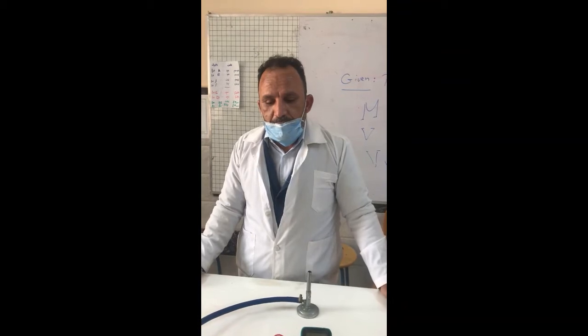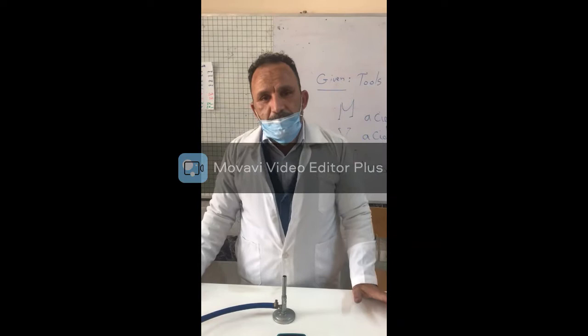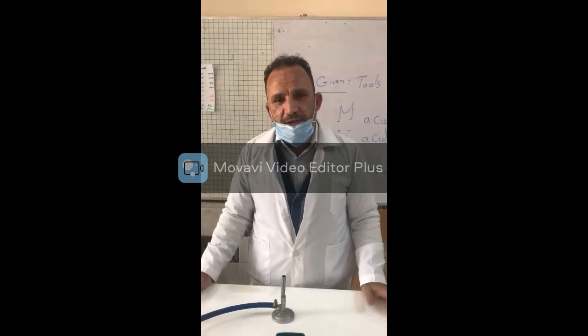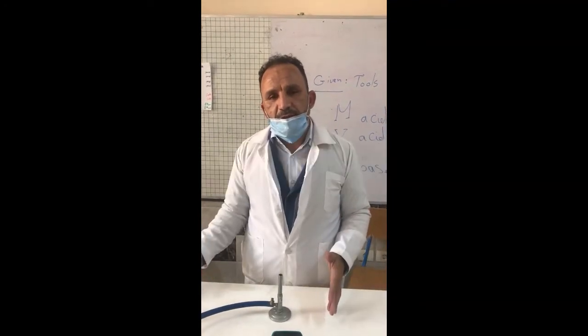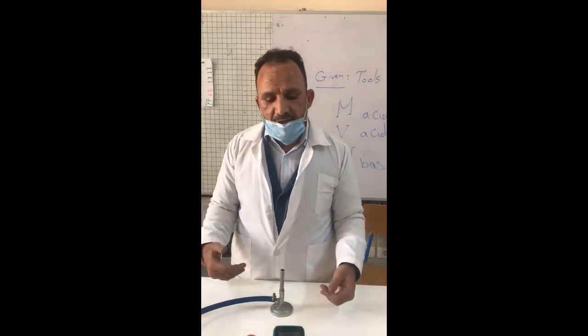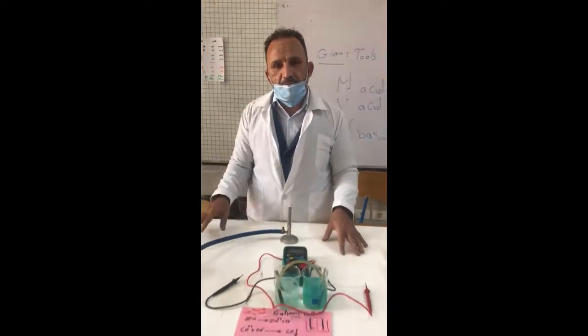Bani Swift STEM School is trying to introduce a practical experiment for grades 10, 11 and also for 12. Our experiment will be about oxidation and reduction reactions. These reactions may be spontaneous or non-spontaneous. Non-spontaneous needs a source of energy, but spontaneous already occurs between two poles.